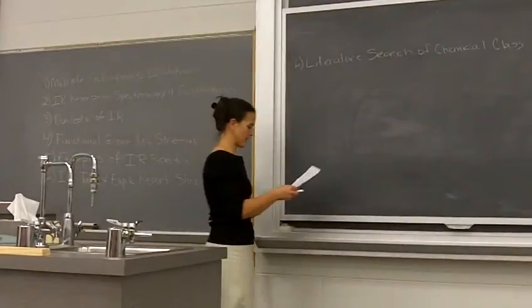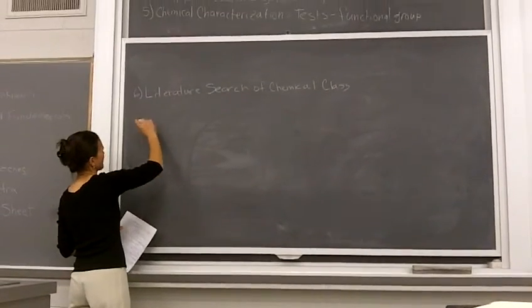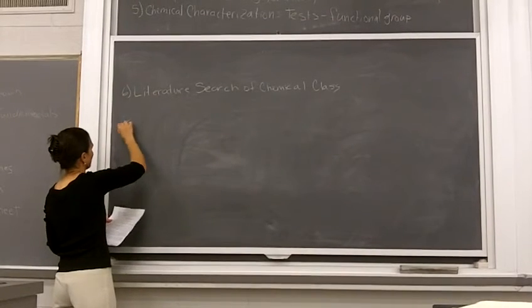All right. So now let's talk about pre-lab, and then give you an example of the flow chart for today, and then we'll look more specifically at IR spectra so we can get back to how we're going to make things match for you.